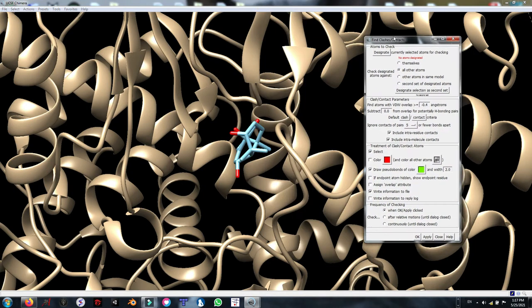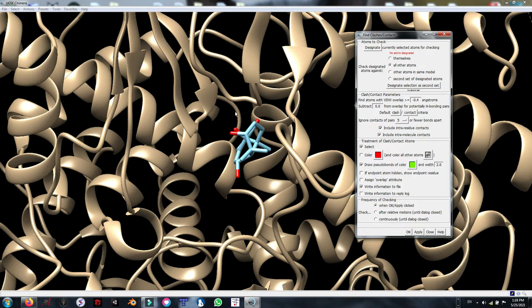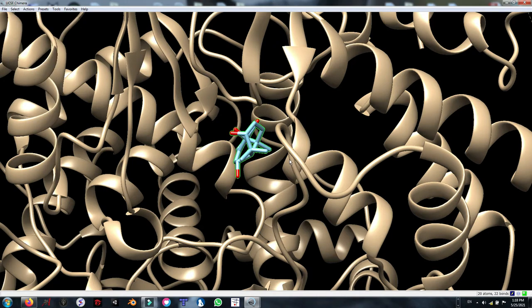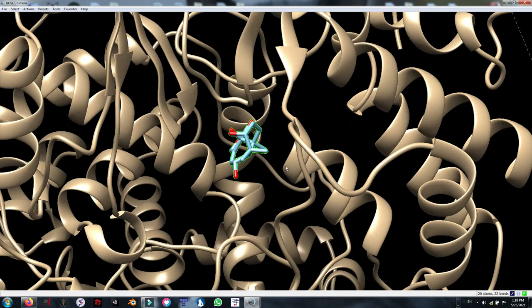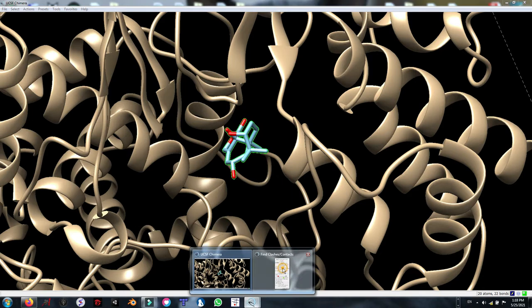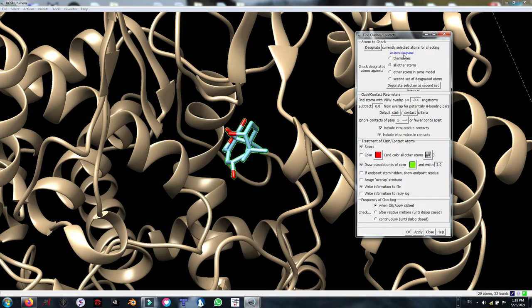Here we need to define the ligand atoms and the second model the ligand is interacted with. Here is the protein as a receptor. Now from the select chain, choose no ID. It's our ligand. As you can see it's highlighted and we can see it is selected. Now designate it. It says that we have selected 20 atoms as our ligands in the first box here.